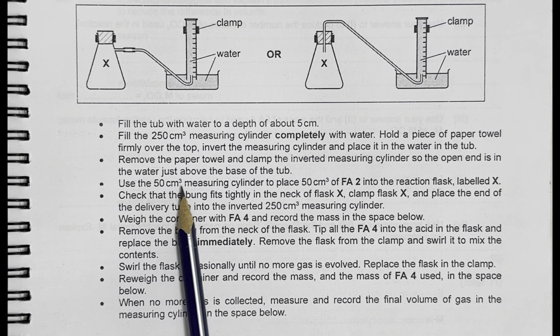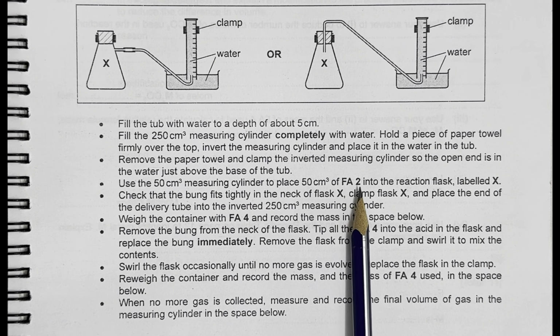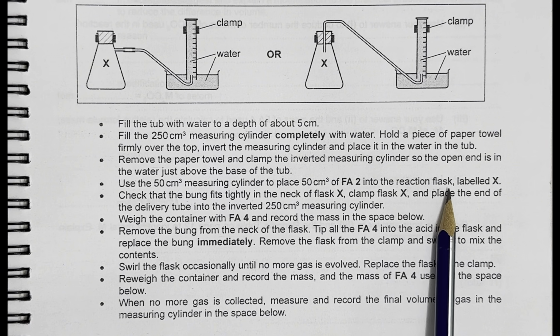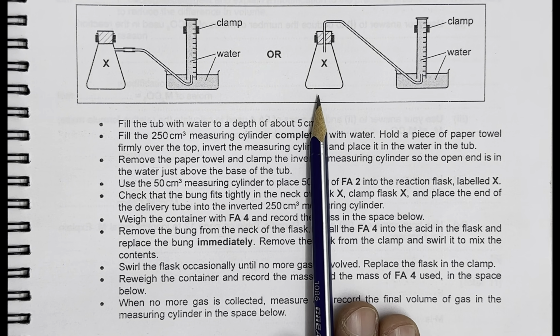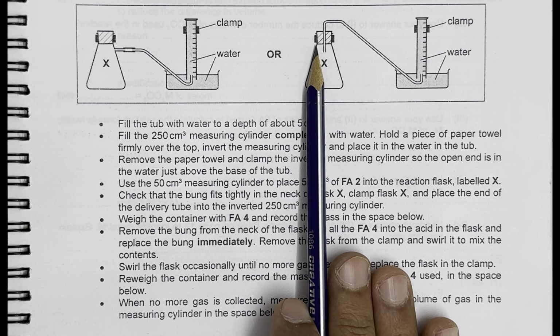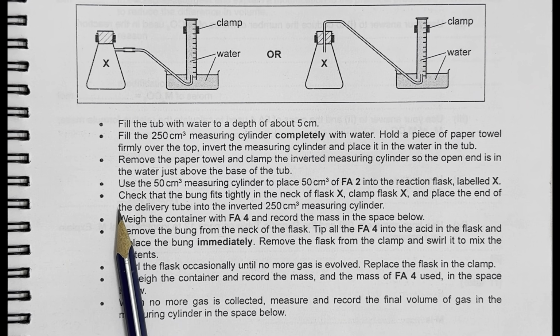Use the 50 centimeter cube measuring cylinder to place 50 centimeter cube of Fa2, which is hydrochloric acid, into the reaction flask, now labeled X. It means this is the reaction flask, which must be labeled X, and then you have to take 50 centimeter cube of hydrochloric acid there.